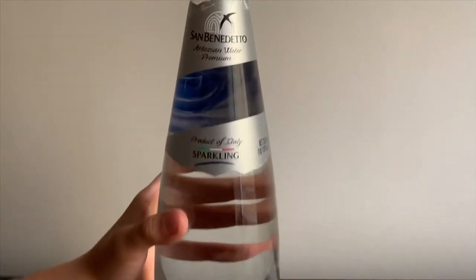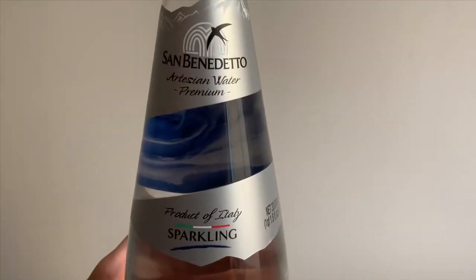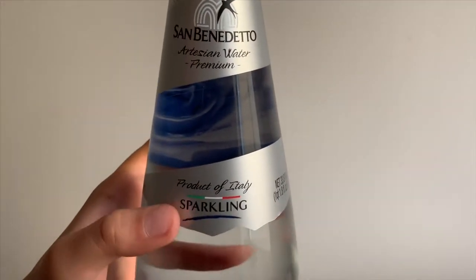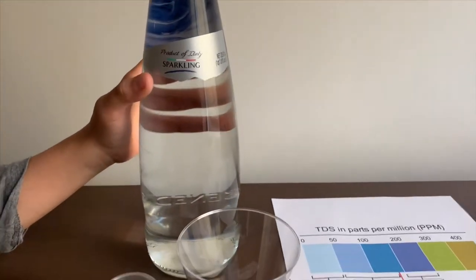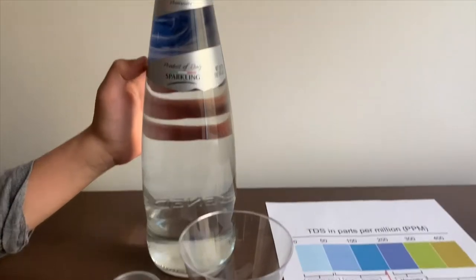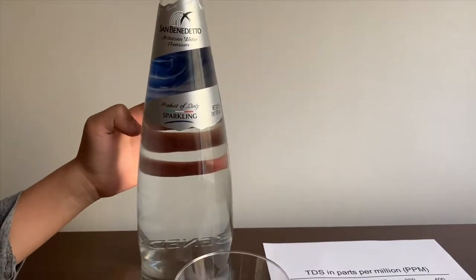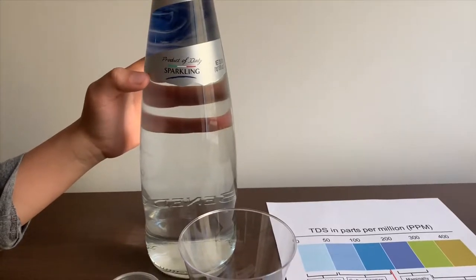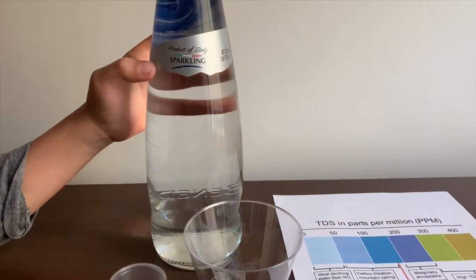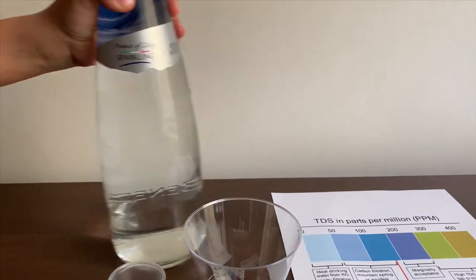This is San Benedito artesian water. It's sourced from Italy and it's sparkling. Remember we tested another San Benedito — the pH was 8 and the TDS was 234. Let's see if they're alike with the sparkling.